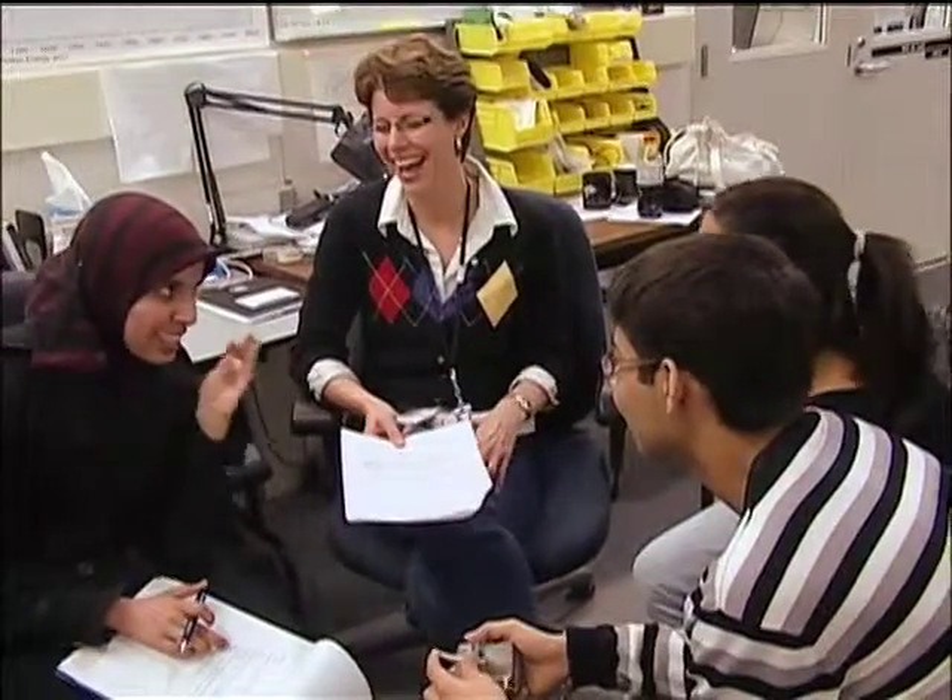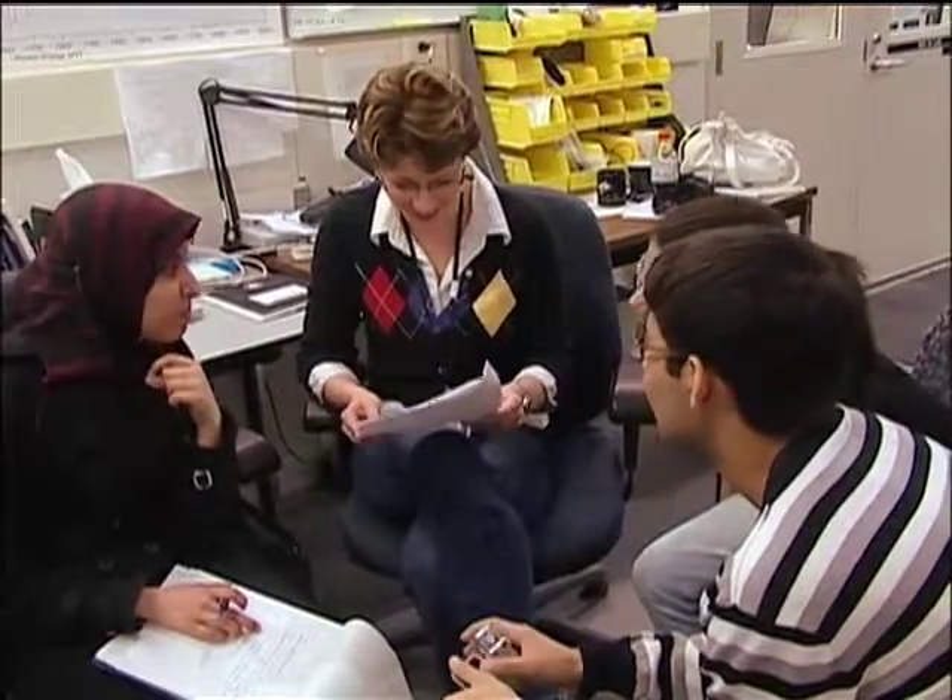I think it's going to help me become a scientist because we can do practical things which can increase our interest, and instead of just reading books, we can gain more knowledge by doing practical things. The experiments are teaching them as well as us, so it's a teaching relationship between scientists and students. Jackie Gregoire is confident her students are getting a lot out of the event. They're absolutely tickled that something they've collected and analyzed they're able to look at at the synchrotron, and they realize that most kids don't get to do this.